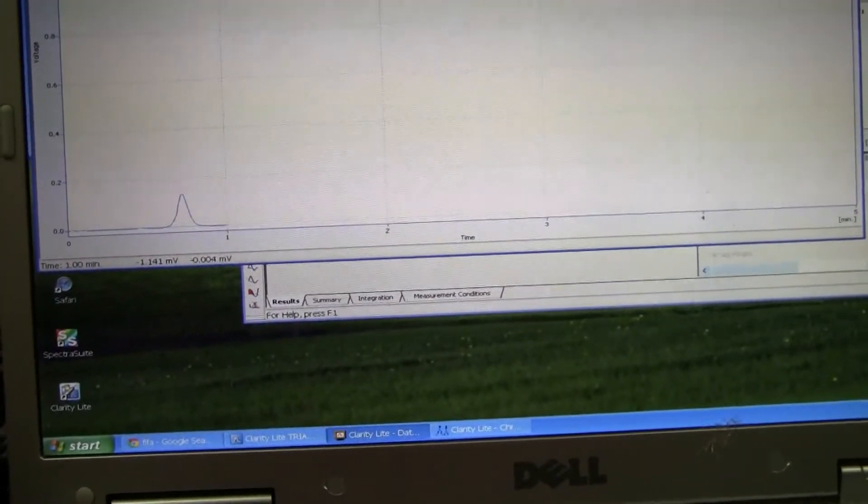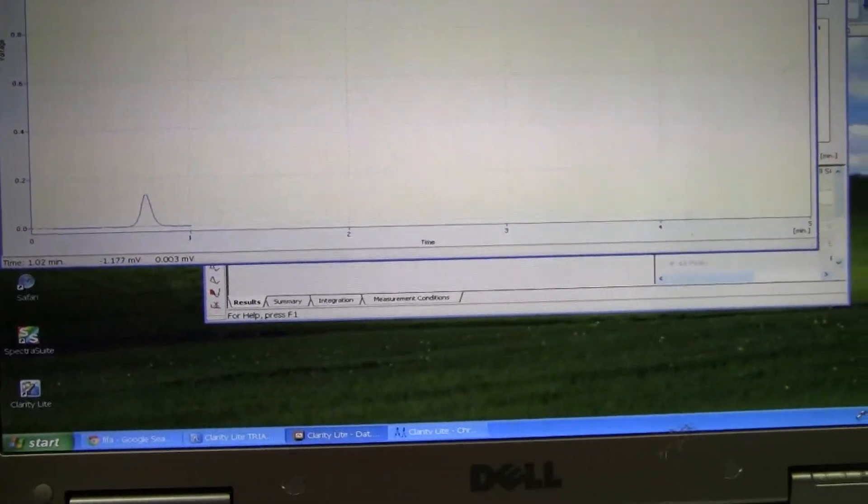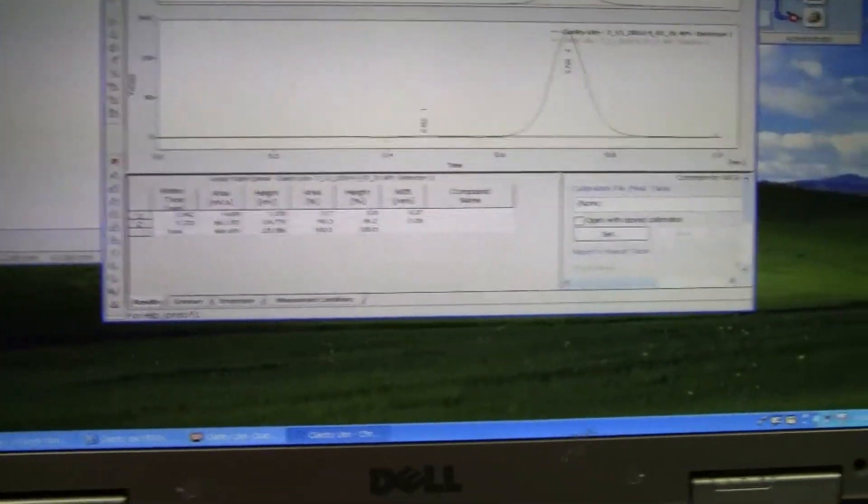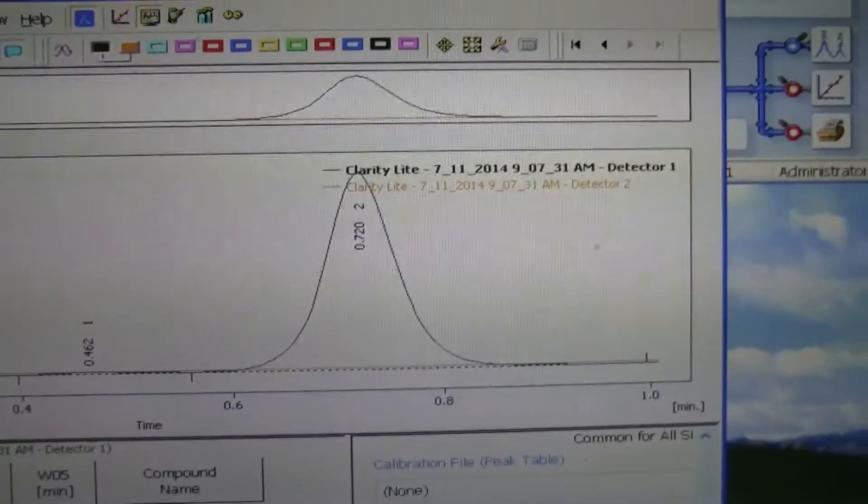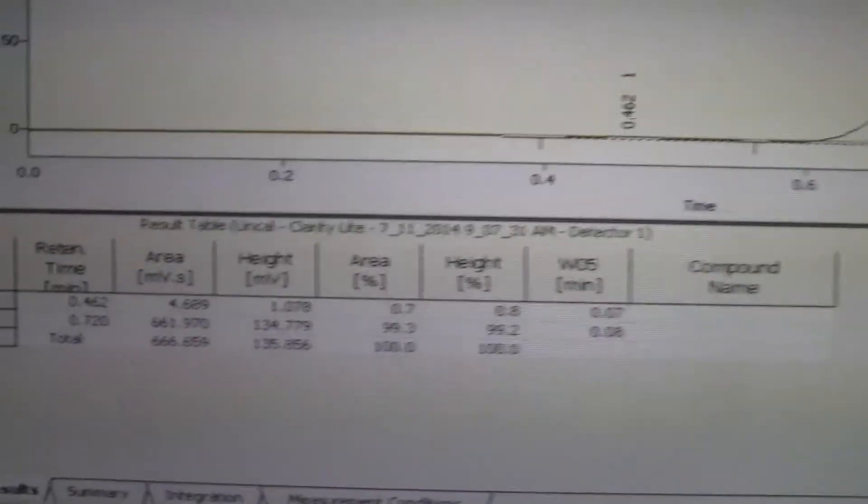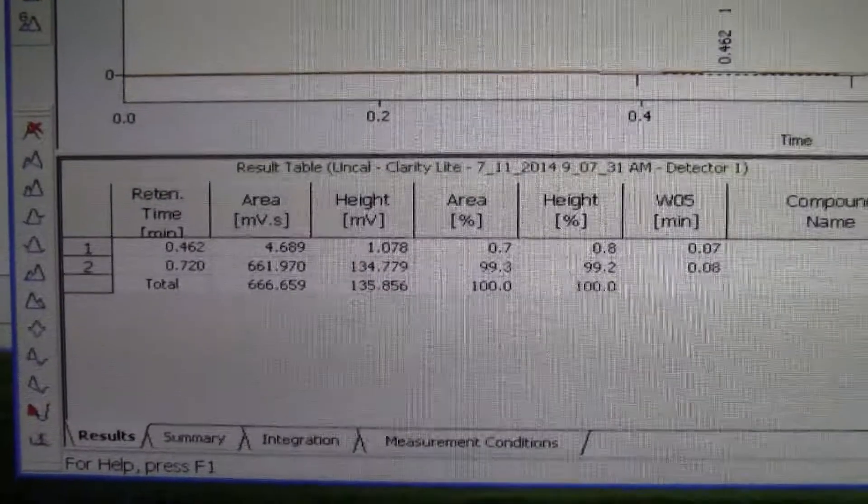Stop the run here. There's our peak, and there's our data.